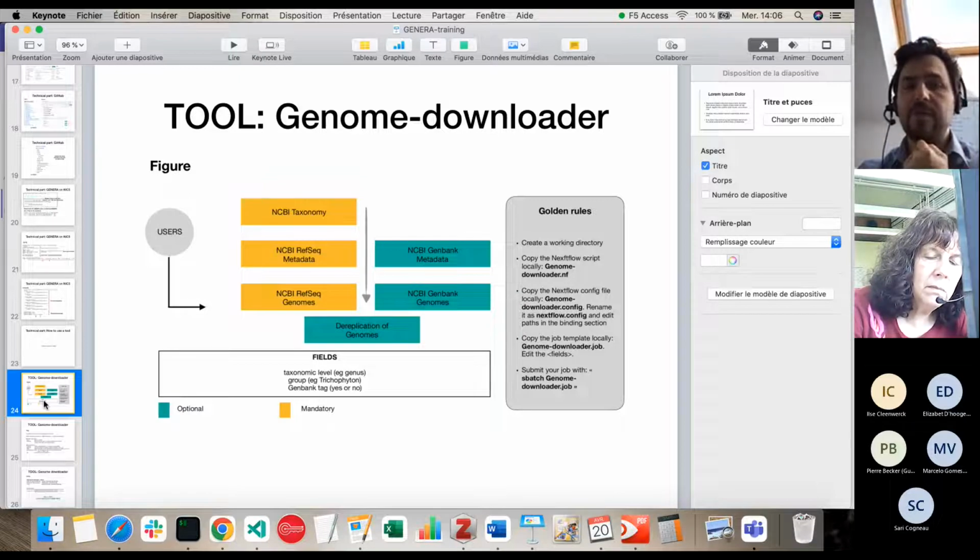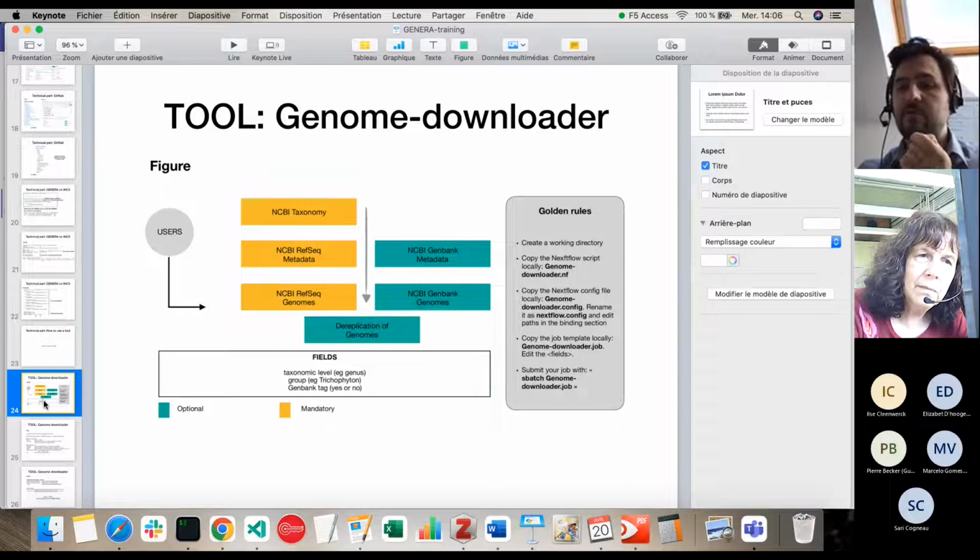They have MASH and ANI, and it will be easier to compare. And you can set the threshold more easily with Torquemada than with dRep. But currently it's not installed. It's also why I don't add a threshold for dRep. I would say that dRep is temporary. It's something to release the tool so that people can use it. But the future is to add Torquemada into this genome downloader.